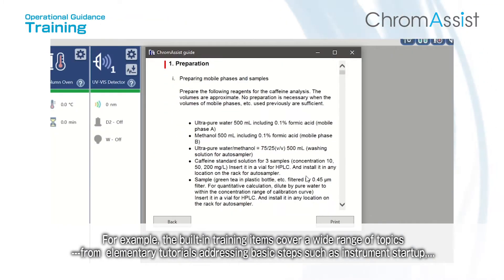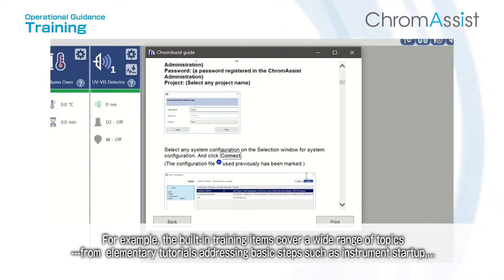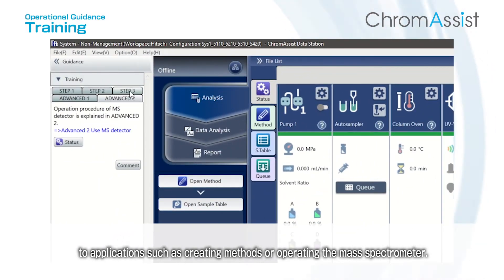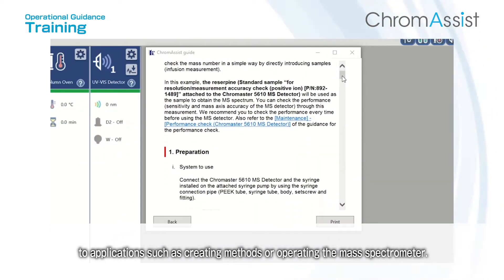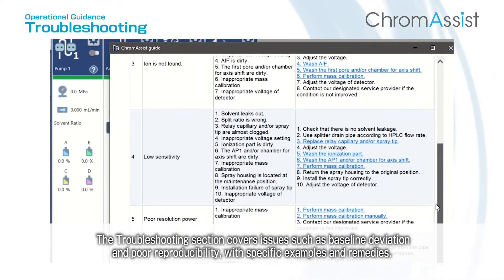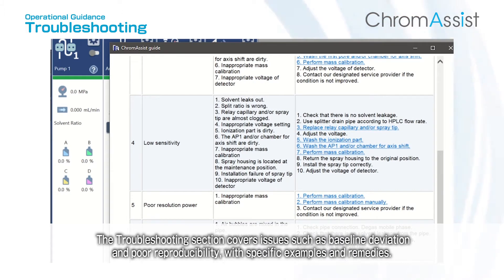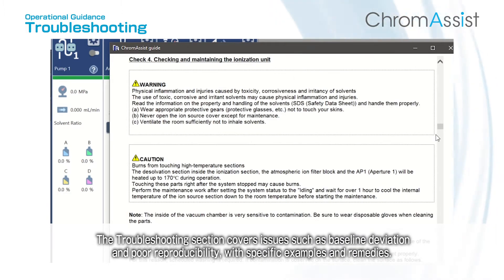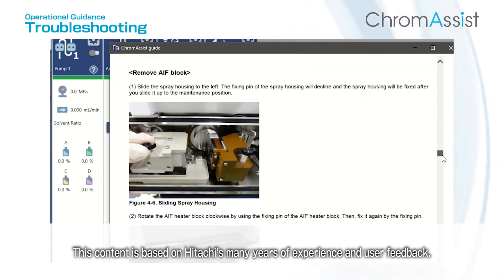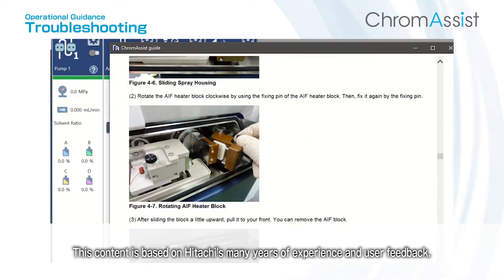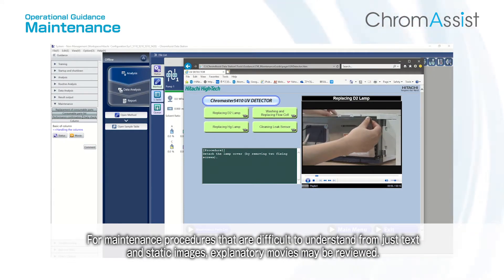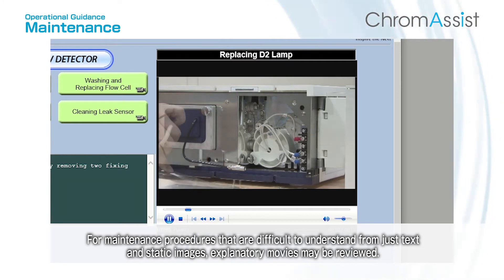The built-in training items cover a wide range of topics, from elementary tutorials addressing basic steps such as instrument startup, to applications such as creating methods or operating the mass spectrometer. The troubleshooting section covers issues such as baseline deviation and poor reproducibility, with specific examples and remedies. This content is based on Hitachi's many years of experience and user feedback. For maintenance procedures that are difficult to understand from just text and static images, explanatory movies may be reviewed.